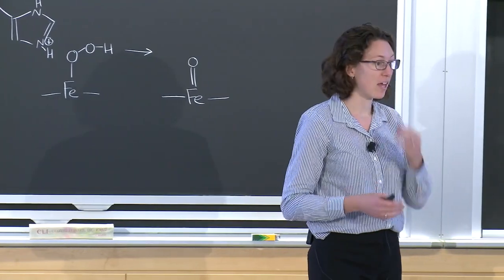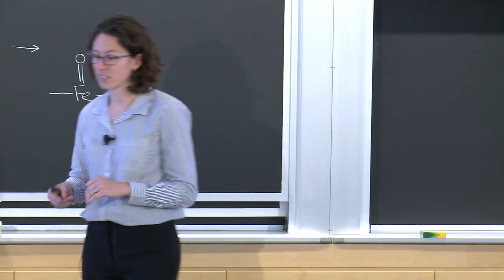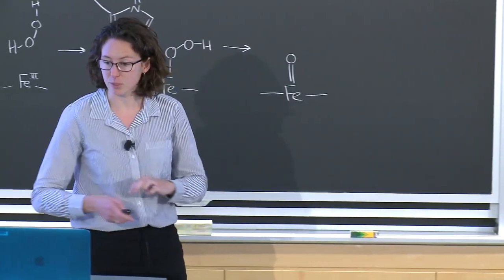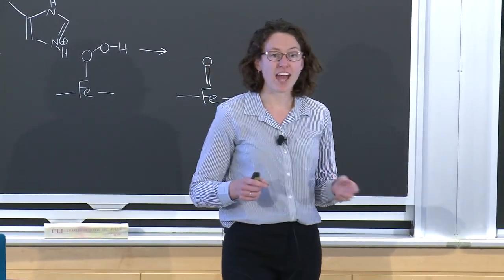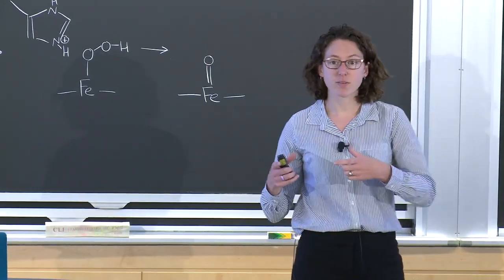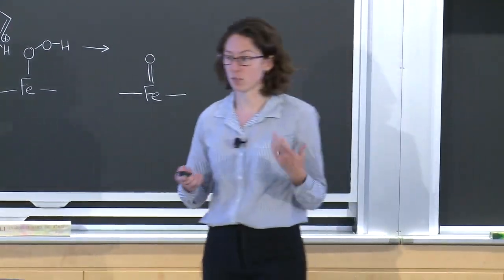For the people who are currently doing the Catalase lab, you've already done part one. For everybody else, you'll get to experience that coming up in the next lab or two. Then in part two of the Catalase lab, we are going to look at quantifying the amount of catalase that we have in a sample, and then looking at the iron centers in the catalase and trying to quantify those as well.